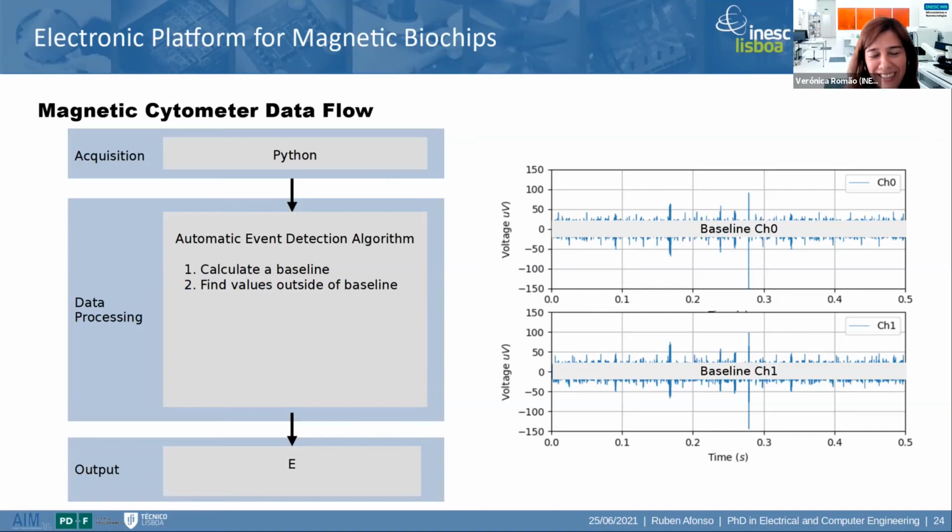No, if we have some particles remaining, of course, the end result, so the number of bacteria or cells counted, will be affected, but the interference that I was talking about is not that. For instance, I was talking about the motor of the fridge starting and generating a lot of magnetic noise, and we cannot use the system on its side, for instance.